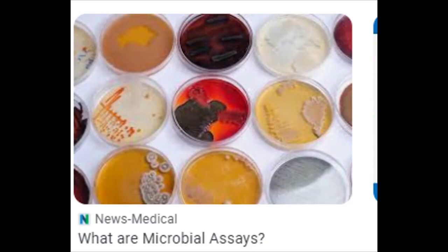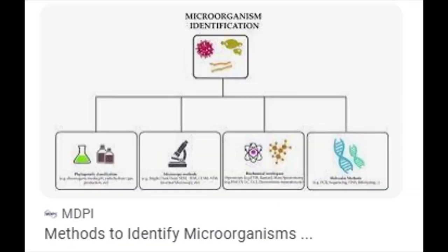Yes, it's a suspicion. Is there a microbe inside? Is there Vibrio cholerae inside the food that is causing cholera? That is why you now have to do cultural technique and other techniques. I hope you get me now. That's why you have to do other tests to detect and to know what the food contains and what it does not contain.